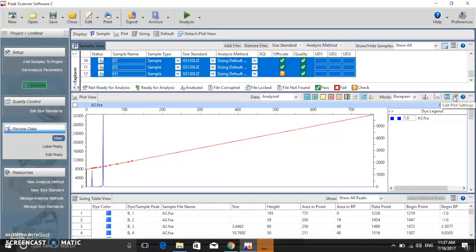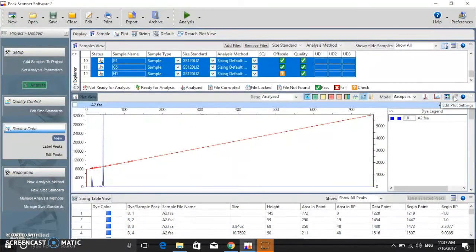Then click Edit Plot Settings. Sometimes the view for plot settings is hidden at the back of the screen.